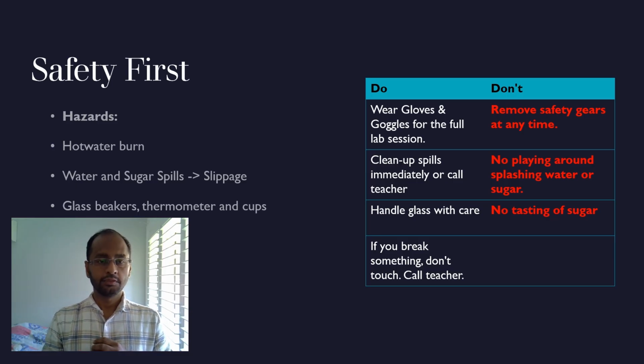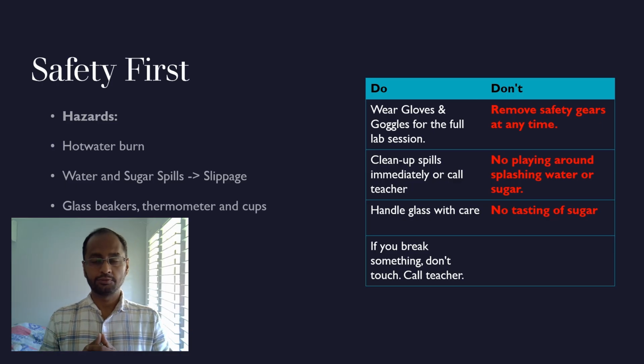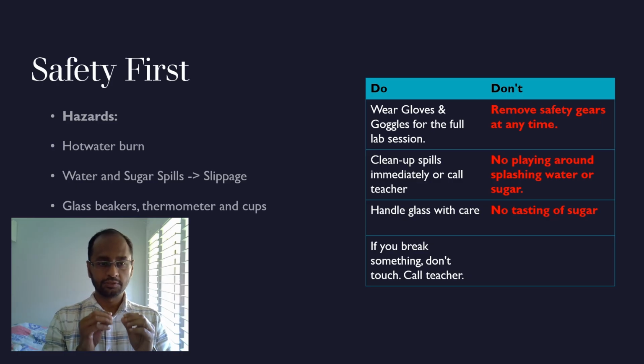That's simple. If you spot any dangers, spills or breaks, stay calm. Don't be a hero in trying to fix things. Call for help. You have me and you have the lab attendants in the lab, so call for one of them. The step by step instructions of what we just spoke about are on your table. Take a couple of minutes to read them before you start the experiment.